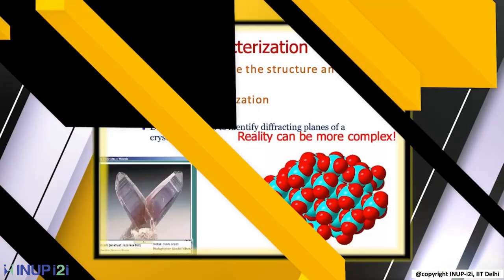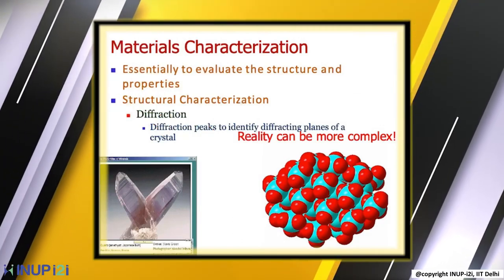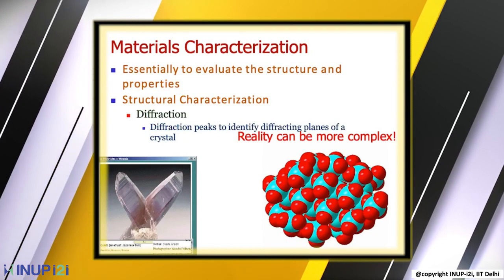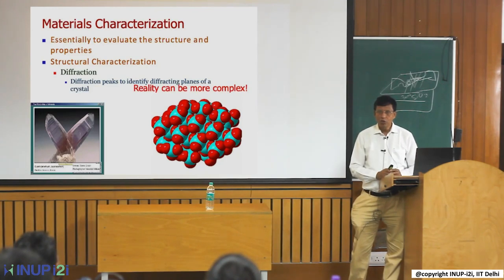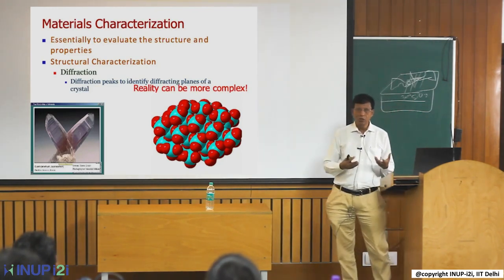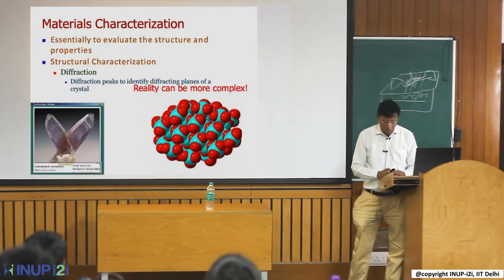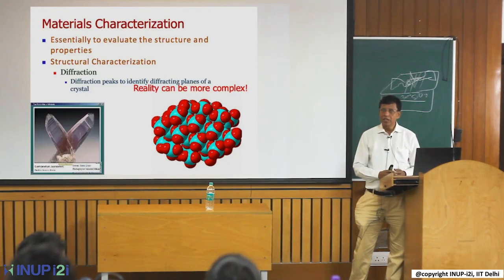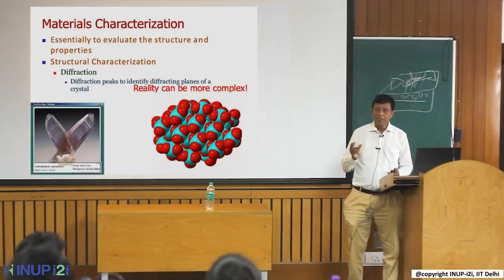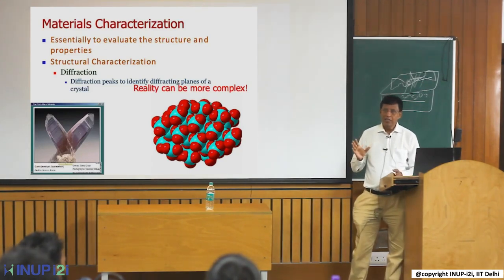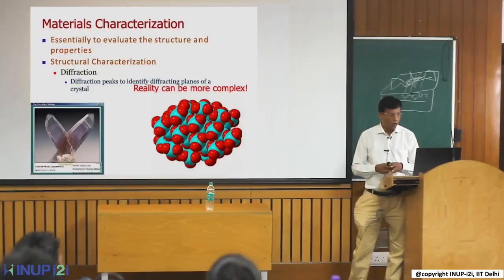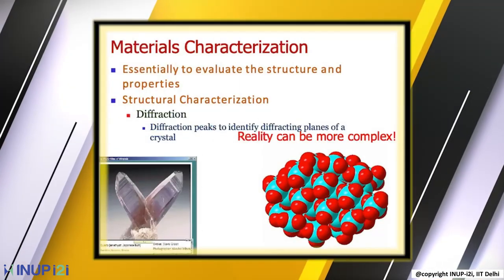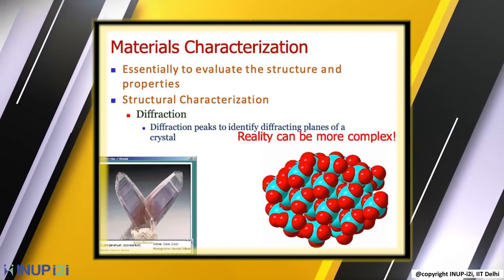Why do we require X-ray diffraction? We want to prepare some materials, but at the end we want to be sure that we really prepared the material we intended. Apart from that, we want to know that the material prepared is really a single-phase material. For example, if I want to make copper indium selenide, I want to confirm that I am not also making copper oxide or indium oxide along with it — only copper indium selenide, nothing else. That is what XRD characterization can help you determine.